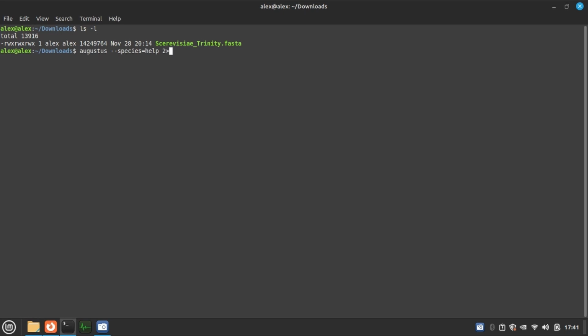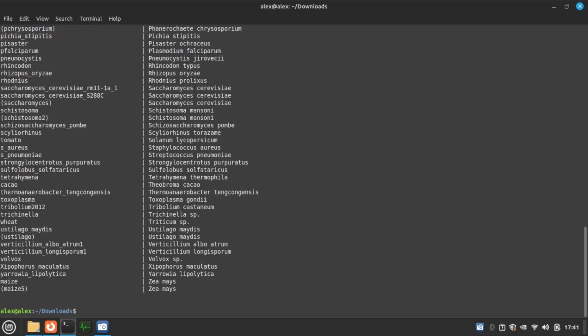For that I'm using this script, with a redirect and tee, and just list and enter.